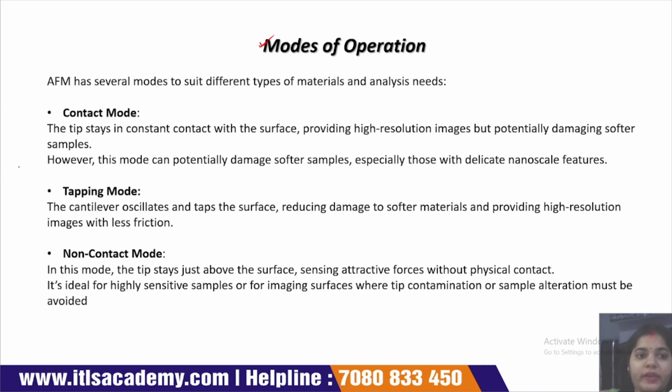Understand the modes of operation. First is the contact mode. Suppose this is a biological sample, and this is the surface of the biological sample, and this is the tip of the cantilever.